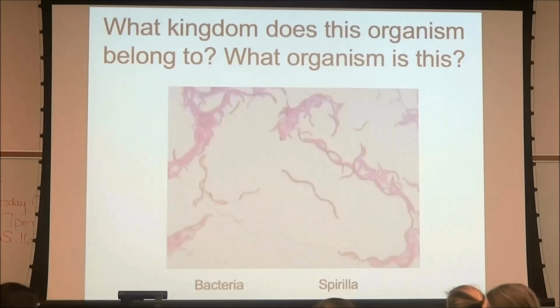Okay, there's nothing else that we looked at that really looked like this. Will the coloring be the same? No, the colors may not be the same at all.